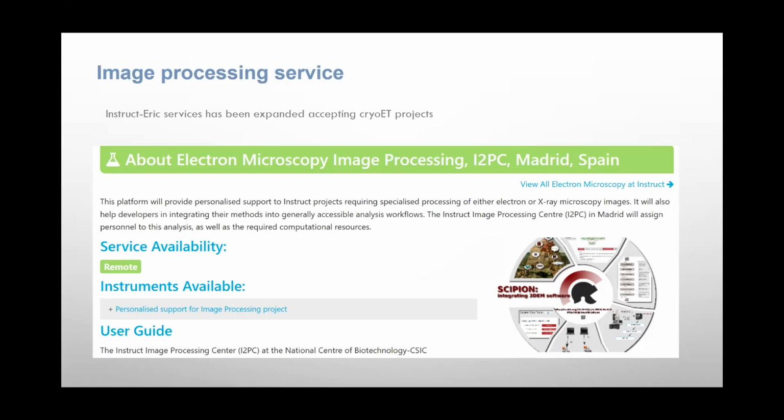If you have a data set that could belong to single particle, flexibility in single particle, or specifically now in tomography, we started recently to accept electron tomography projects, and we provide, I think, 15 days of image processing for free for your sample. You have to write a short project to Instruct, but if the project is accepted, we provide the image processing as a service for free. So feel free to contact us in that regard.